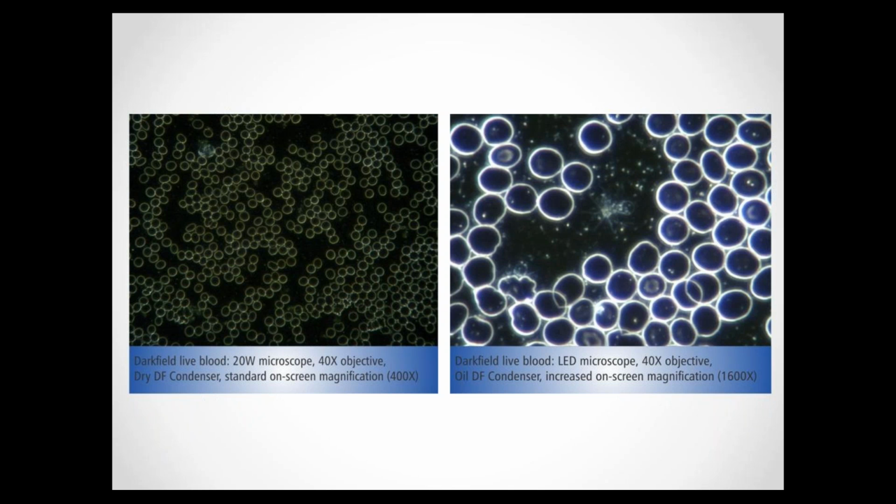Now this is quite standard for most of your objectives. But when it comes to dark field, we need a lower aperture than the standard aperture size for the large 100 times objective. If you use a standard 100 times oil immersion objective in dark field, you would not really be able to see much at all unless you're able to adjust the aperture.